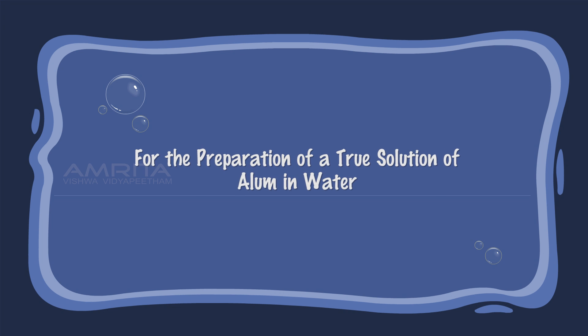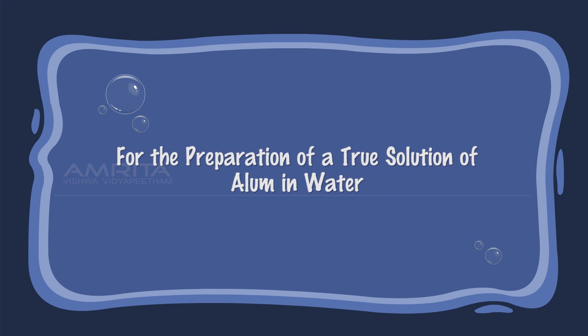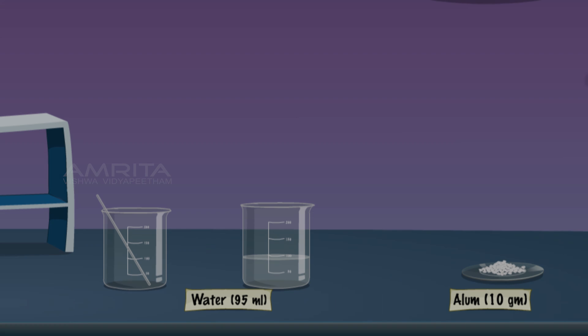For the preparation of a true solution of alum in water, add 10g of alum in a 250ml beaker containing 95ml distilled water. Then stir the solution using a glass rod until the alum dissolves.